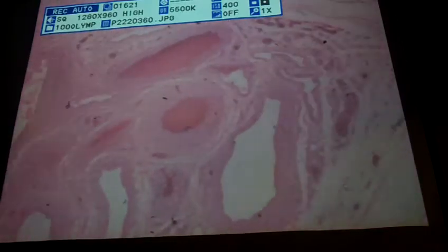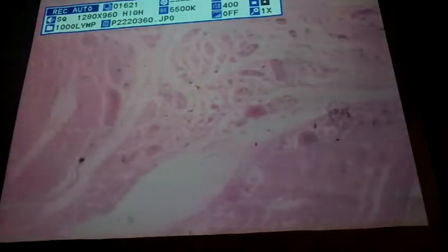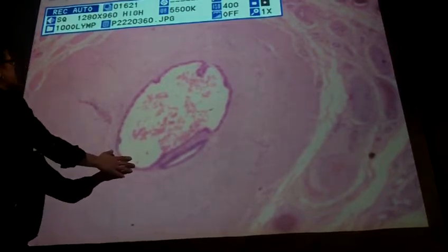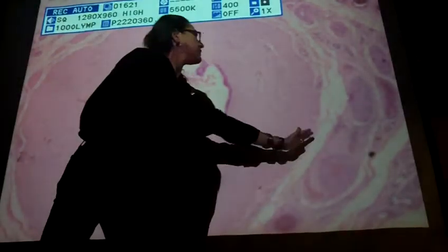When you scan around here, you want to look for the biggest circle possible, and obviously you guys won't be scanning on the test. It'll be at one spot. But when you're studying, you want to look around. That is the biggest circle in that slide. This is your ductus deferens. So it's going from here over to here.